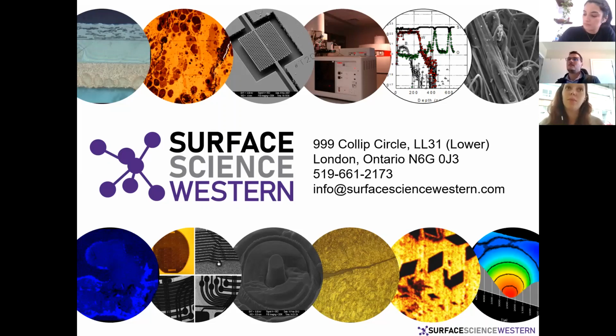Because when you start saying you've got chromium 6 within something, people are going to say, well, that's dangerous, and they're going to get very worried about it. So you want to make sure that you're really seeing the peak. That's why I put a detection limit of around 5 to 10%, depending on the instrument and on the system, and how strong your spectrum is.